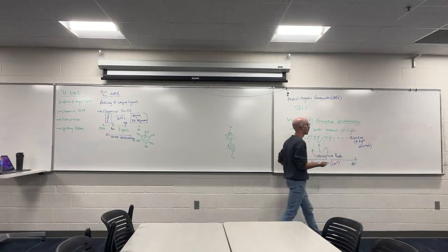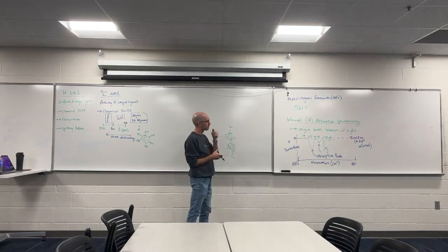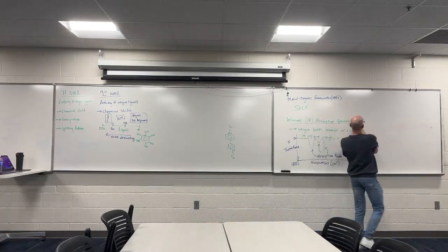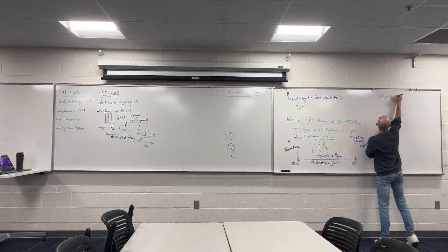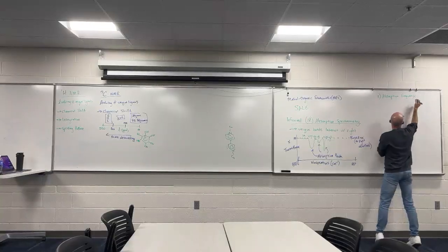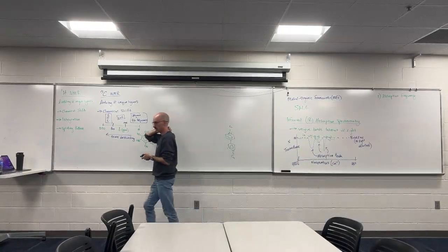So here are the things that we want to analyze when it comes to IR spectroscopy. First, we'll look at the absorption frequency.